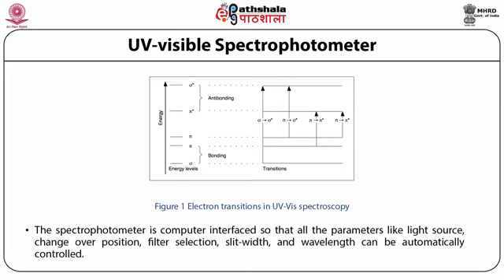The spectrophotometer is computer interfaced so that all the parameters like light source, changeover position, filter selection, slit width, and wavelength can be automatically controlled.